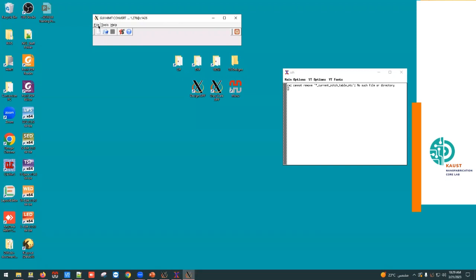From here, we just need to click File, New Job, or this icon that you see. And this is how we start a new translation job.